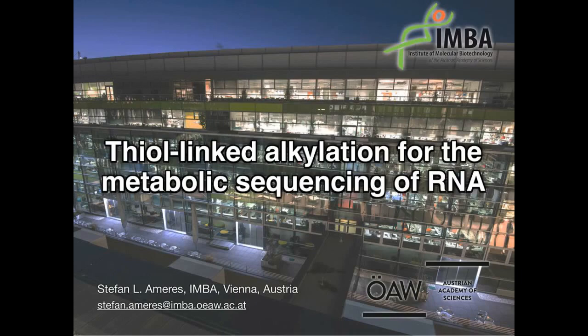Thank you very much, Judy. So today I would like to introduce you to a novel gene expression profiling protocol that we have developed at the Institute of Molecular Biotechnology at the Vienna Biocenter in Austria, which adds a novel dimension to the analysis of standard high-throughput RNA sequencing approaches. And this is the dimension of time, which enables us to gain insights into how gene expression programs are actually established in order to study the regulation of gene expression at the transcriptional as well as at the post-transcriptional level.